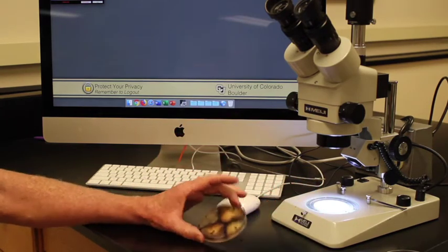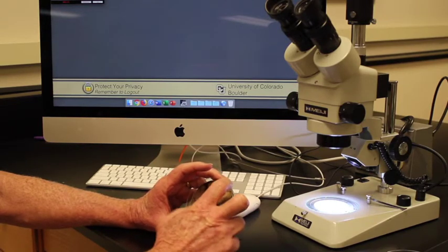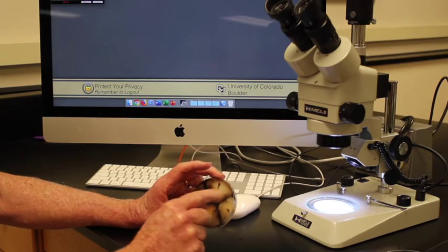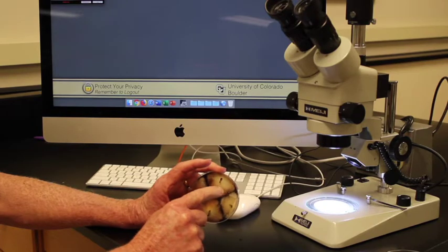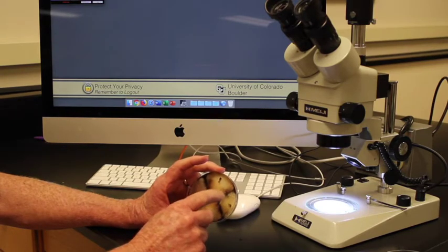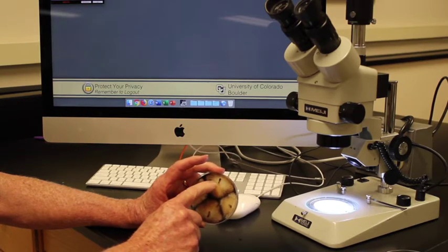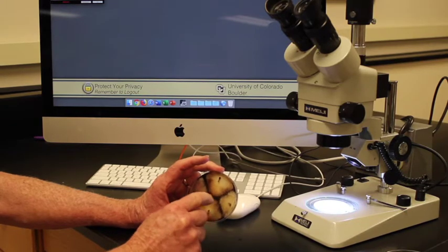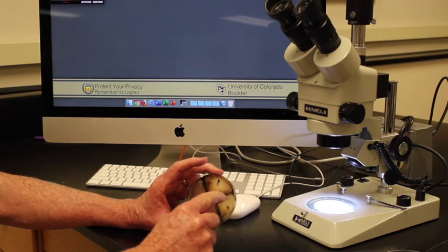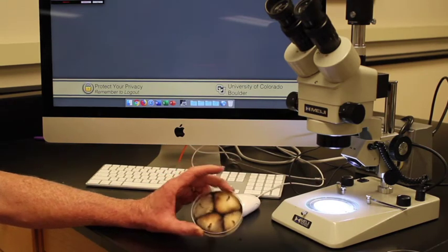Okay, so that's what's going on here: we had spores here, the hyphae then grew out, and those hyphae grew out into mushrooms. All these little black dots in here are mushrooms, and we're going to look at the actual spores inside these mushrooms. The interesting thing about these spores is that they are colored. Our tan strain makes tan spores. Our wild type strain makes black spores. So we're eventually going to move to a compound microscope and look at the distribution of tan and black spores in these mushrooms.